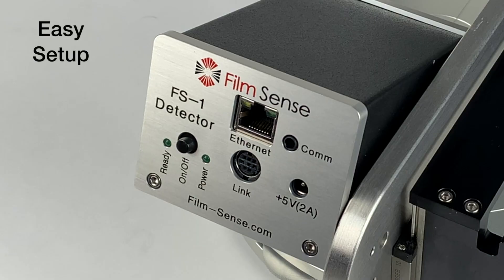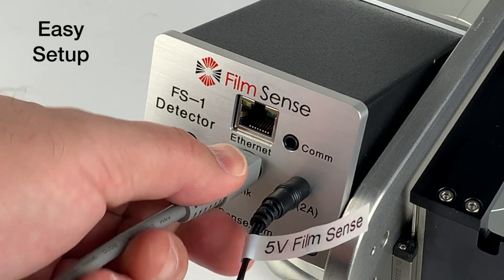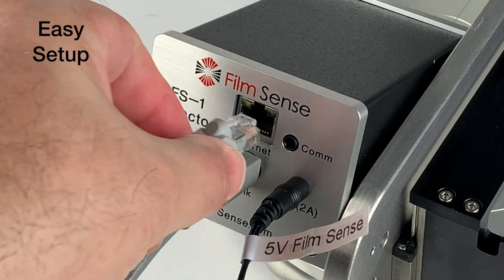It is easy to set up a FilmSense multi-wavelength ellipsometer. The only connections are for power, a link cable between the detector and source units, and an ethernet connection to the web browser computer.